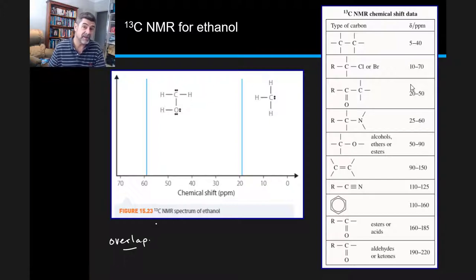so ambiguity is now going to creep into some of our analysis of spectra. And the reason for that is because some of these values are a little bit or are contained within different ranges.